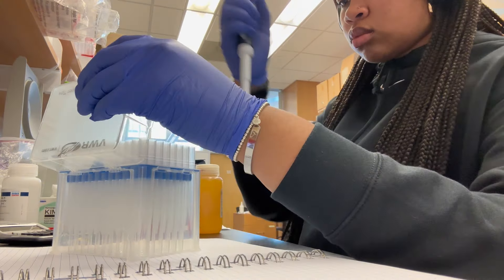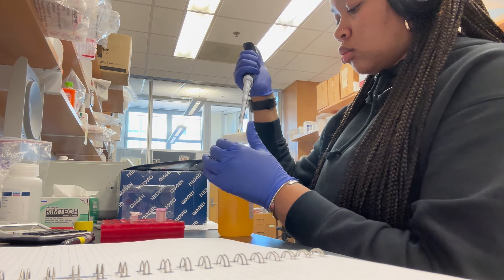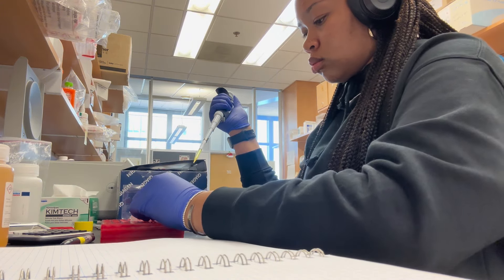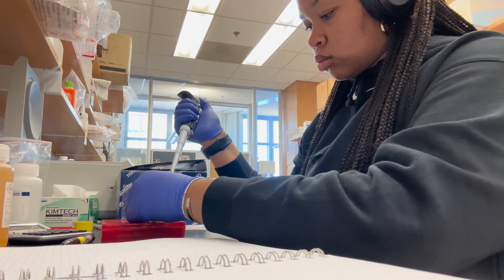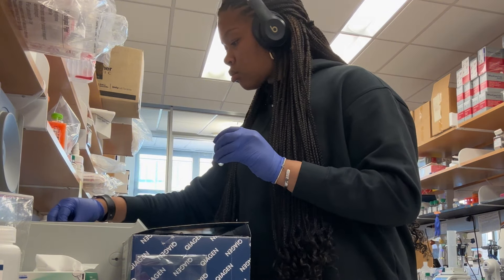So I have my one sample, and then I'm also doing a control. Because when you use the centrifuge, you want to make sure that you have a balance. So I'm just doing two just to make sure. And I label my sample that I will be using. Pretty quick and easy.